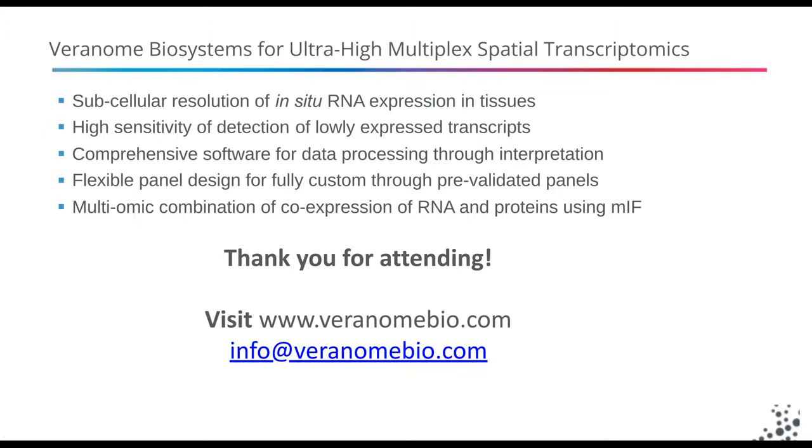So our next question, can your cell segmentation parameters be adjusted and optimized by the user?